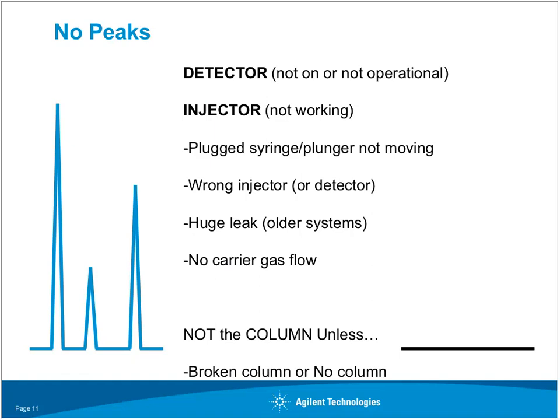Okay, so let's look at another example of no peaks. The simplest way to look at this is, well, maybe the detector is not working or is not operational. The other thing could be the injector's not working. The third problem could be that it's a plugged syringe.